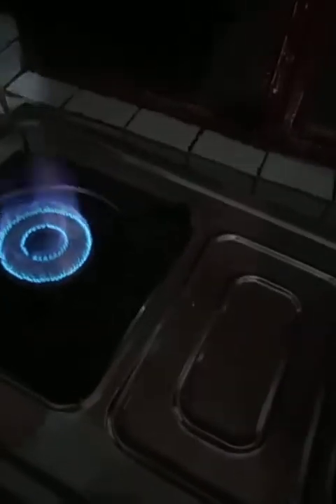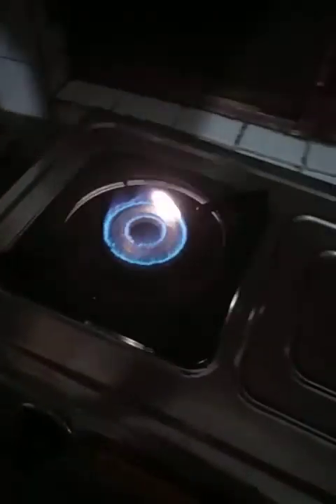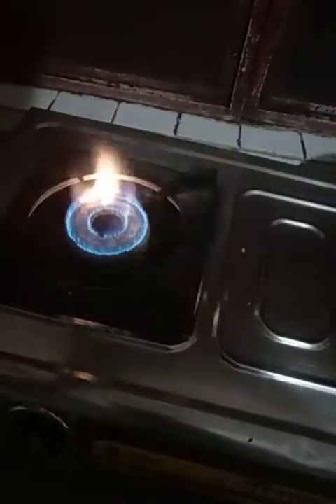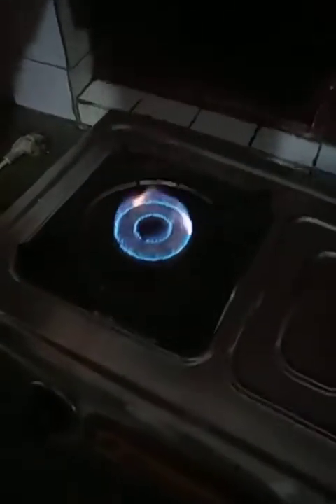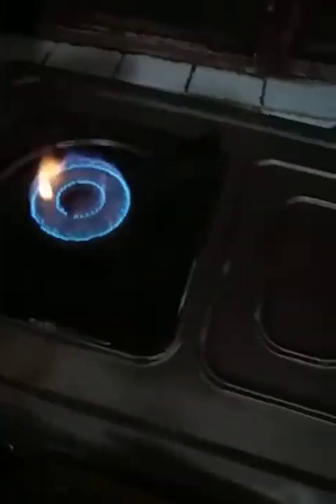Let me reduce the flame for you so that we can get a better color. You can see the violet color produced. And then if we add the sodium chloride, it is going to give us a golden yellow color.